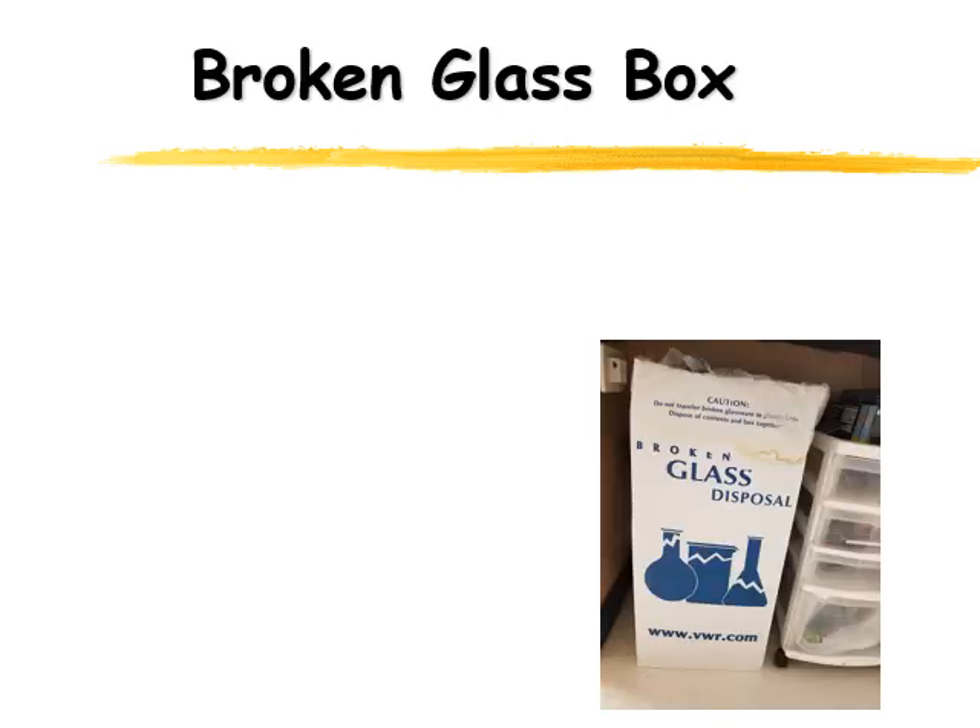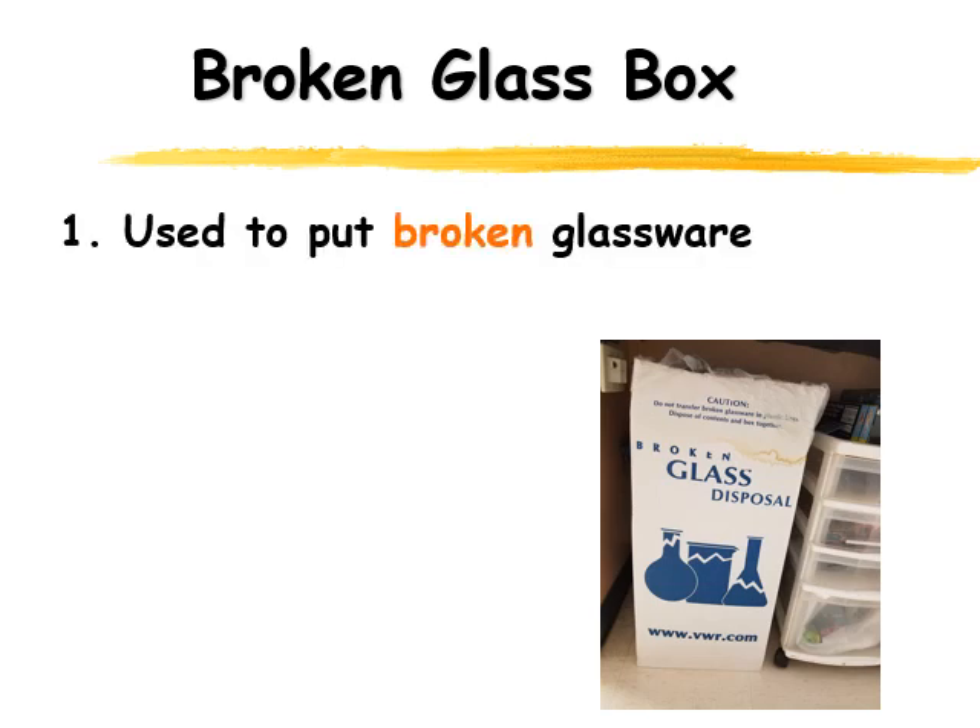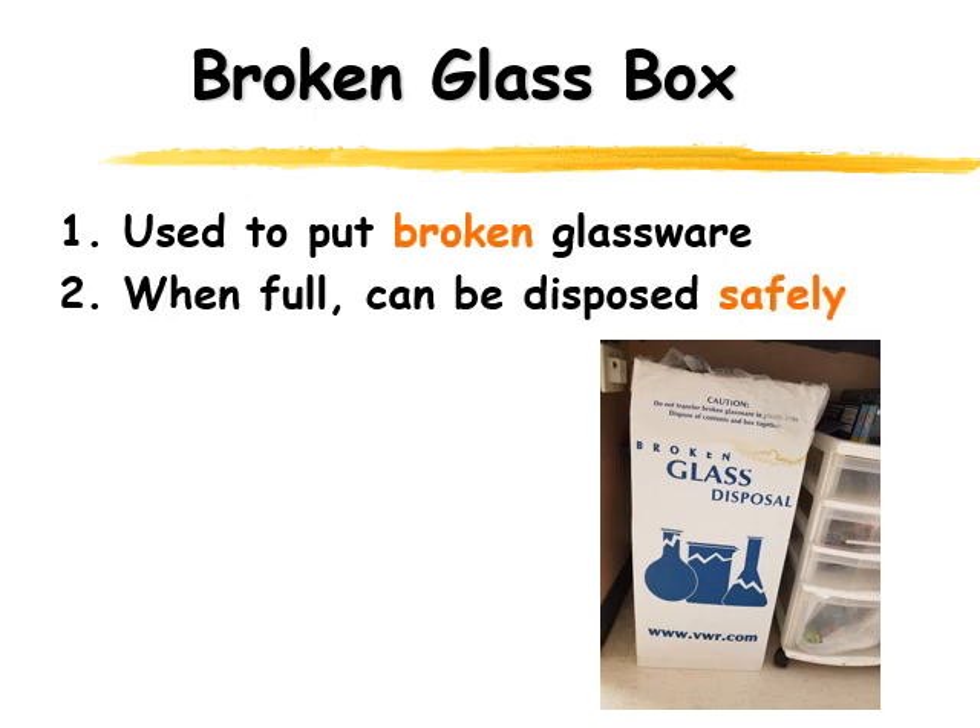One of the other things you'll find in the classroom is something called a broken glass box. This is a box designed only for broken glass — it's where you put your broken glassware. Stuff that's really dirty or contaminated would not go into this glass box; that needs to be disposed of differently. Accidents are going to happen in the classroom, so you just use a broom and dustpan to clean the glass up, put it into the broken glassware box, and once it's full it gets disposed of safely.